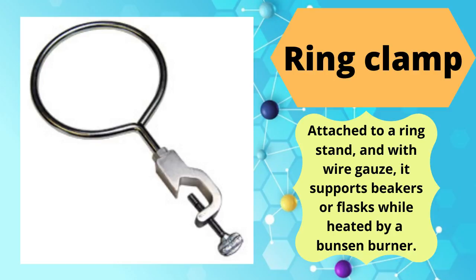Ring clamp, attached to a ring stand and with wire gauze, it supports beakers or flasks while heated by a Bunsen burner.